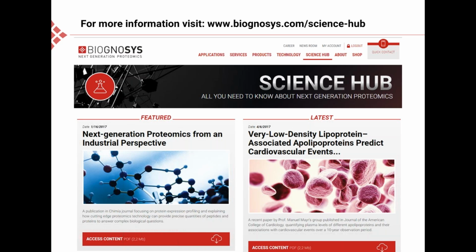The first question we have is, which Excalibur software versions are supported for panel export? Right now we'll have a new update of SpectroDive in the next couple of days, and then it's up to Excalibur 4.